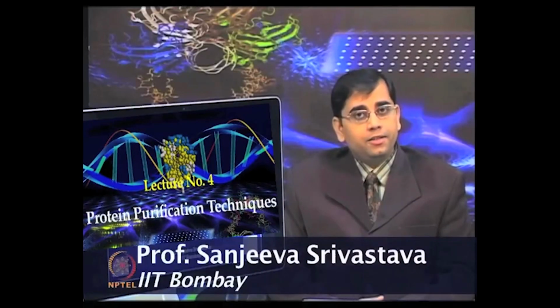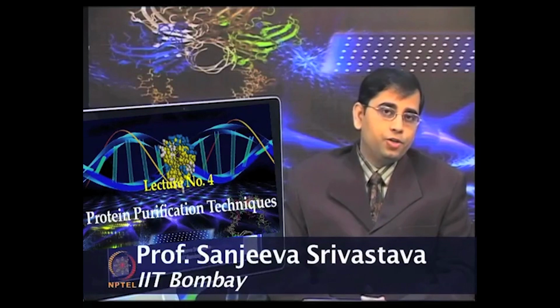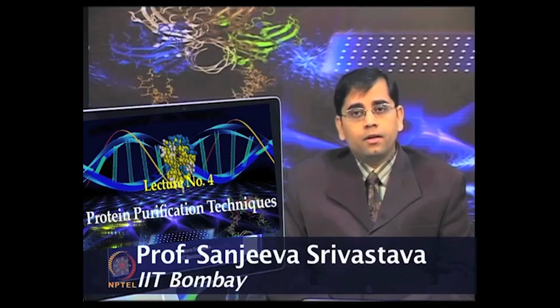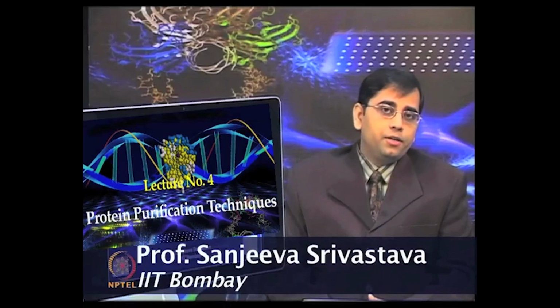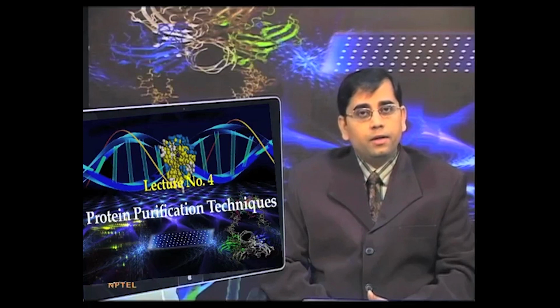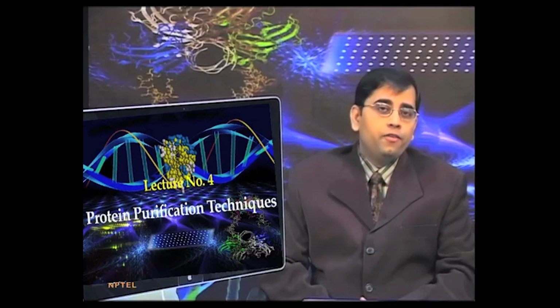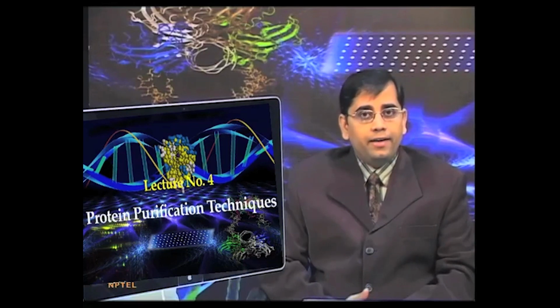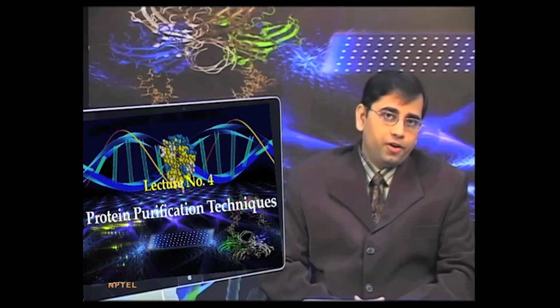The chromatography techniques have always been considered prominent for the separation of enzymes and proteins. Protein purification by conventional chromatography is usually achieved by combining chromatographic methods such as gel filtration, ion exchange and affinity chromatography.